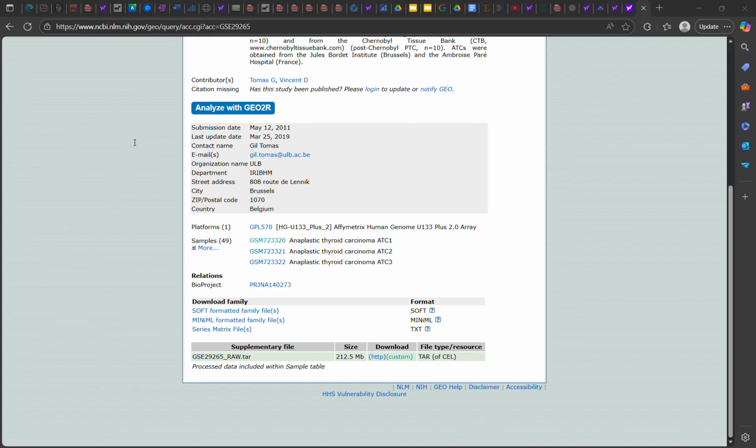I want to just ignore this. I had to put that in just to try and figure something out. Didn't really work, so I commented it out. It's not really important. So that's been run. Now this is stored in GSE. So let's just open up the GSE right here. As you can see, it's all set up in these kind of sub things, so you can't really see everything, which is why we're not done yet.